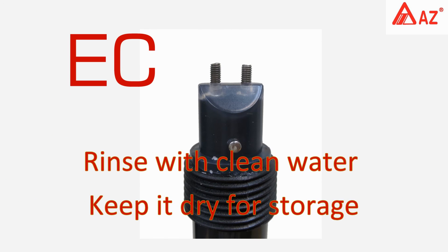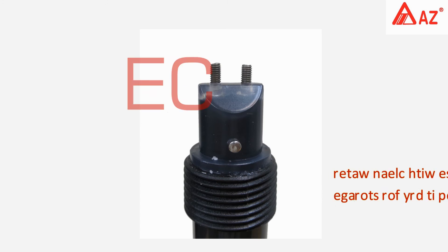For the conductivity probe, rinse with clean water, then wipe dry and keep it dry for storage.